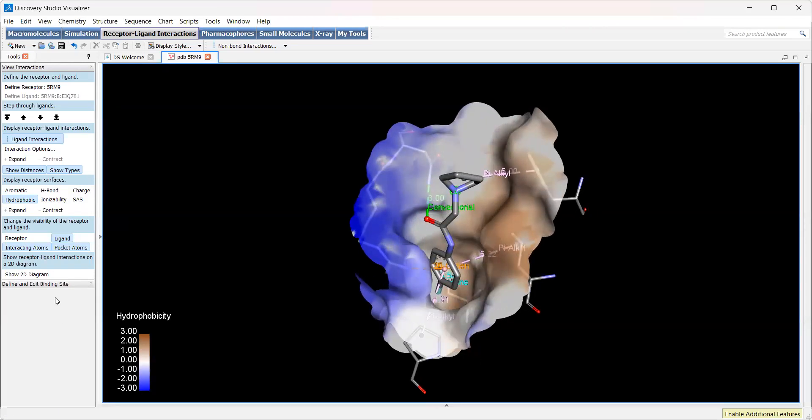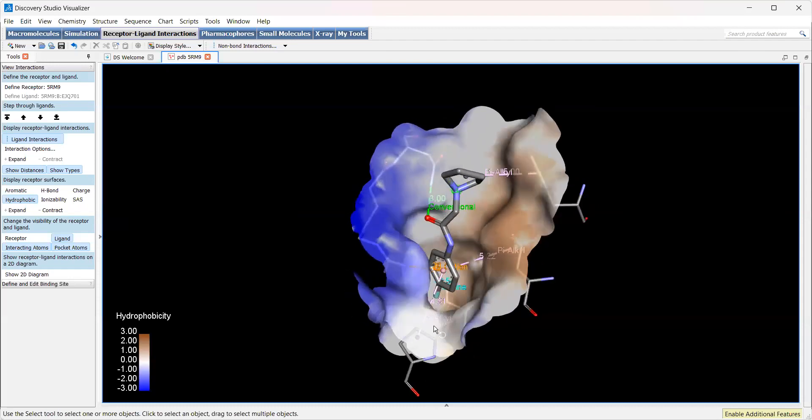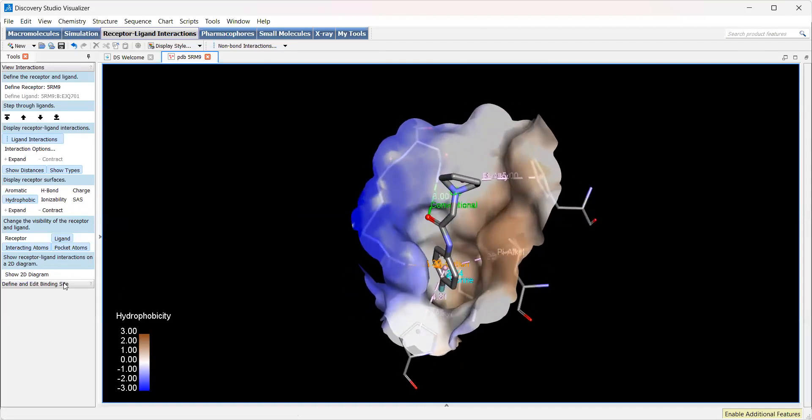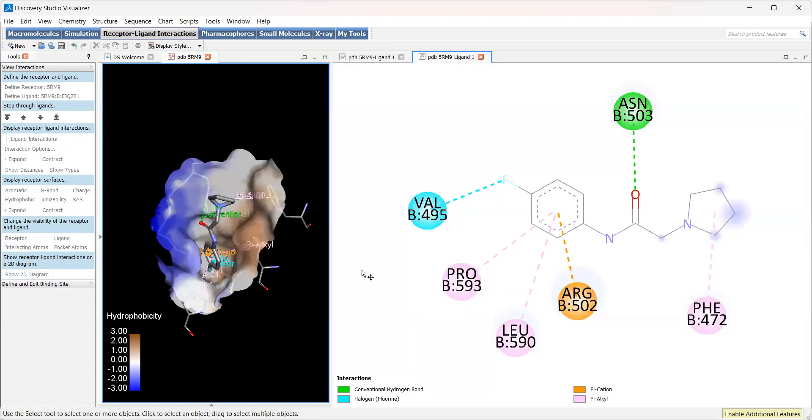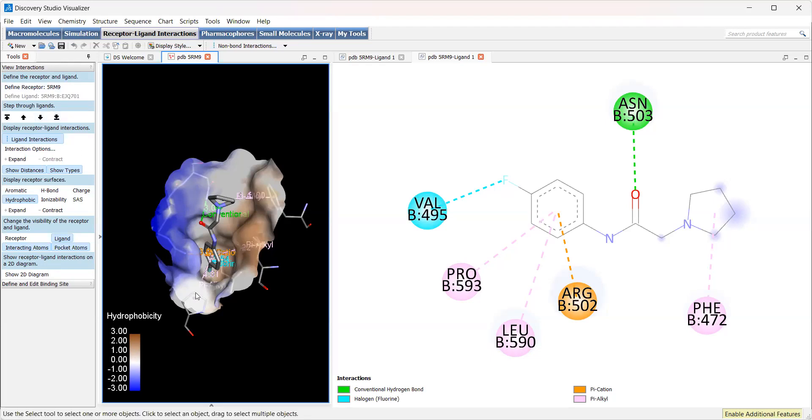One thing we can do to simplify this for publications or for 2D is click on select show 2D diagram, and it will create this 2D diagram of the fragment interactions, which is very useful for us as well. This is all useful information going forward because we can compare these interactions to any fragments or small molecules that we dock in AutoDock Vina.